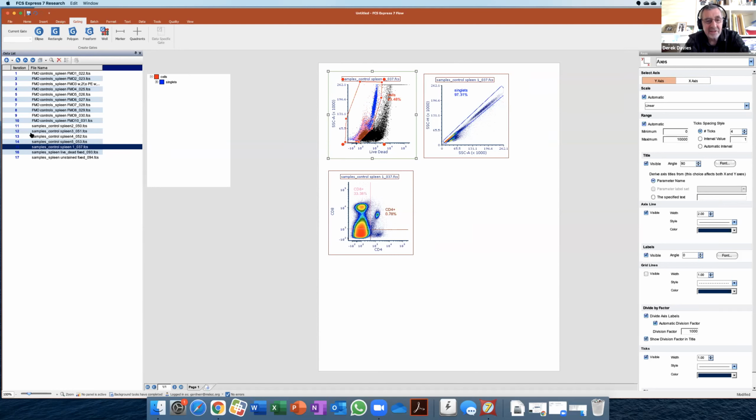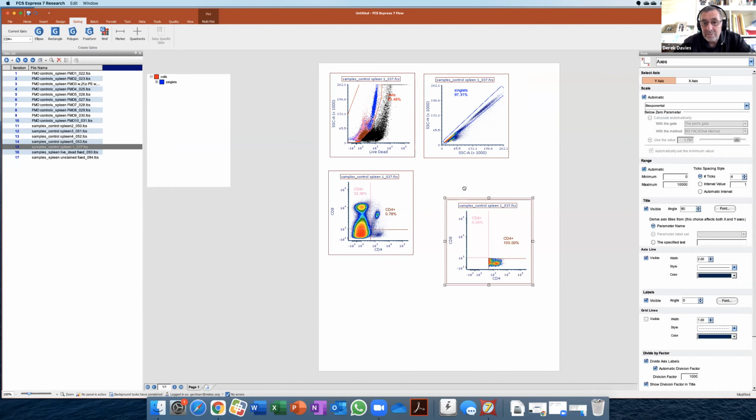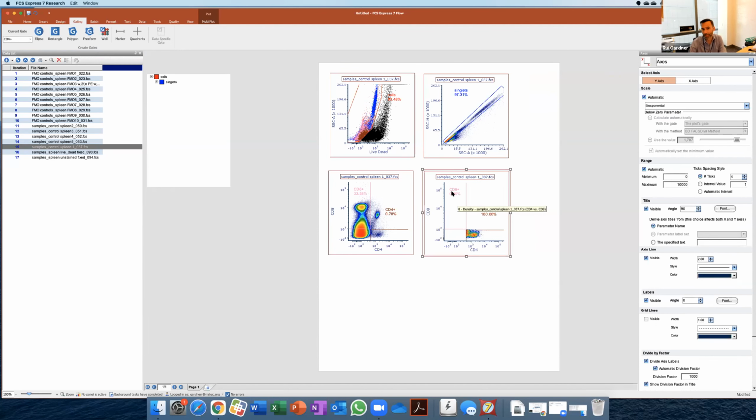I think there's a question there. I don't know if you were addressing that, Kathy, or I was slightly looking the other way about the fact that you get a slightly more spread in the negatives, but that could come from multiple sources, couldn't it? It could be that there is actually some low-level staining in there. Mm-hmm. It could be that maybe you're getting a bit of background staining, but as Kathy was saying, this should have been optimized in terms of titration. Yeah. Or it could be that you've rushed your last wash as well, isn't it? That's right. You've got some free antibody knocking about, which is contributing to background as well. So there are several. You have to be sure that it's a biological effect and not something that you've introduced into it. Exactly. Yeah, absolutely.